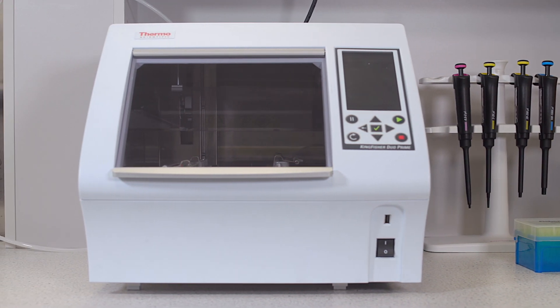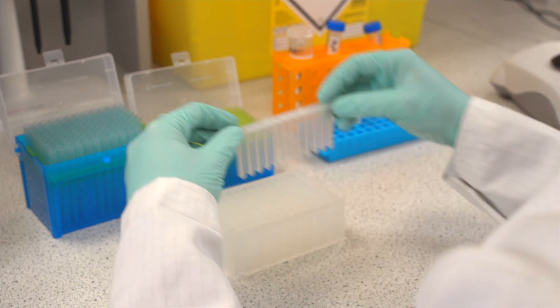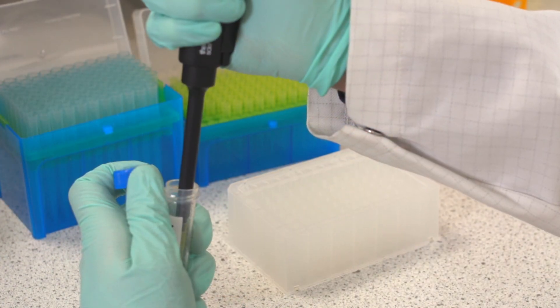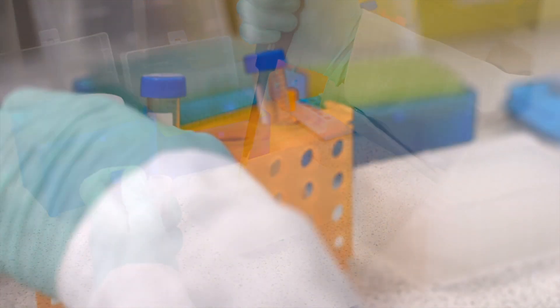The Smart Digest kits are easy to set up and the KingFisher digest protocols can be pre-programmed and started at the push of a button. Here we have a KingFisher Duo 96-well plate. Start by adding your 12 tip comb in row B. Next, add 200 microlitres of water to row F — this will be your wash line.